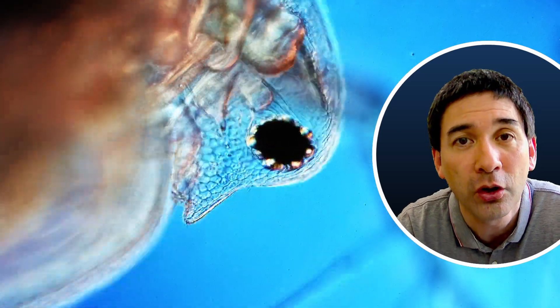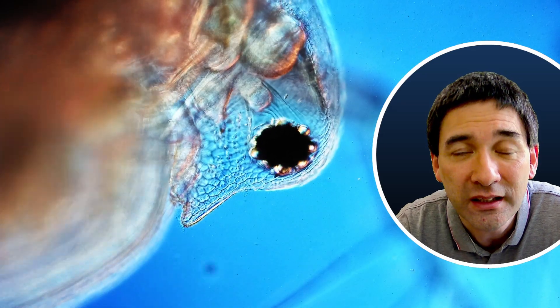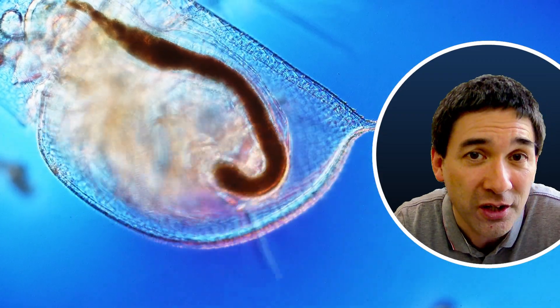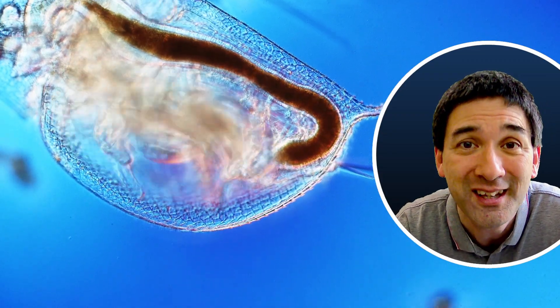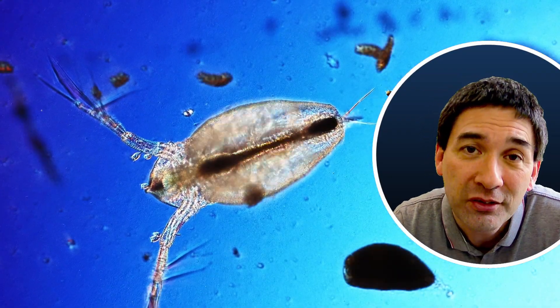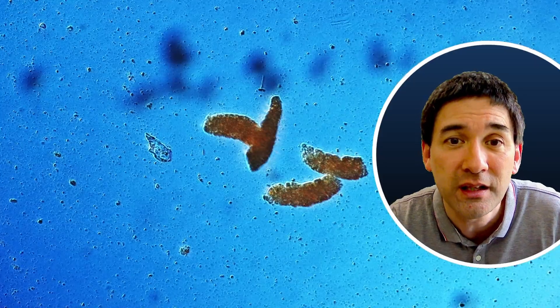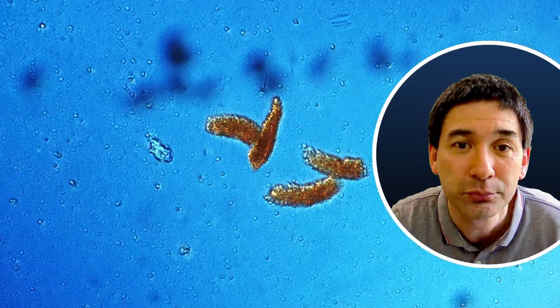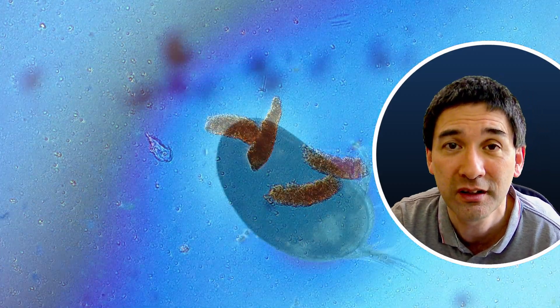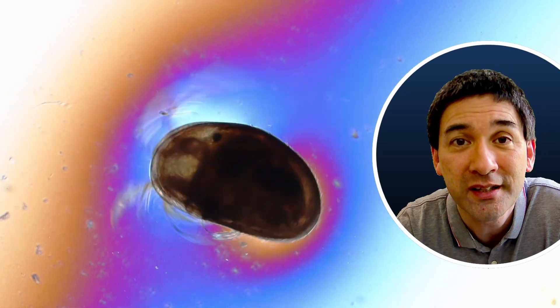All of them share one thing in common: they are arthropods, meaning they have a hard outer exoskeleton with soft organs on the inside — which are very nice to see due to their transparency, showing the working of the inner organs. This here is a larva, so there were also larval stages in there, and the waste they produced shows the water must have carried quite a few nutrients. The rainbow colors are because of the polarized light.